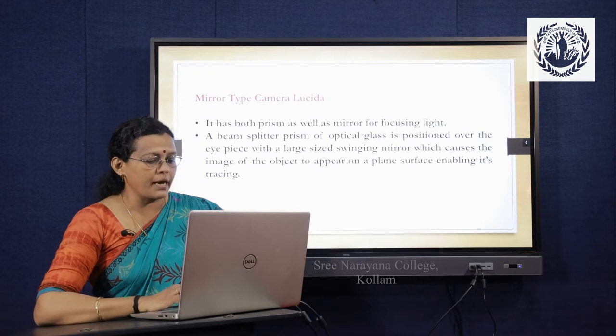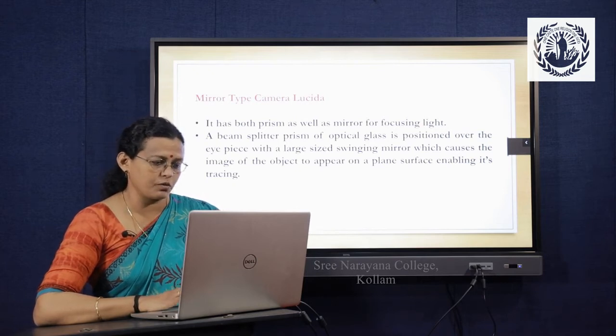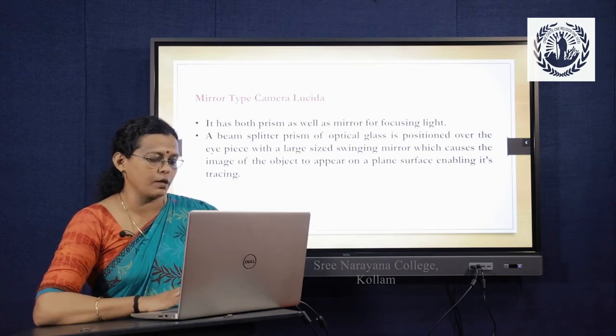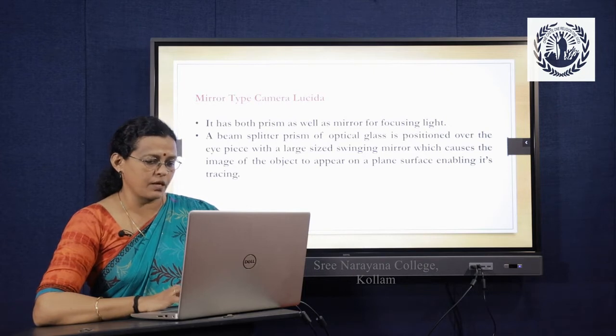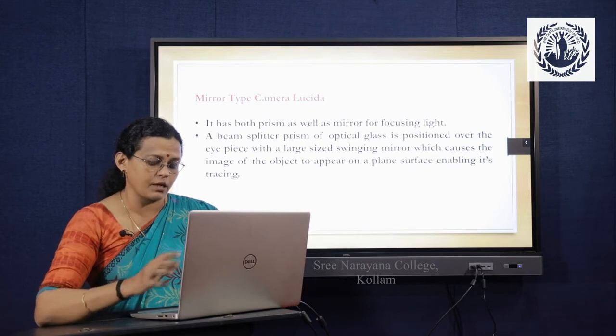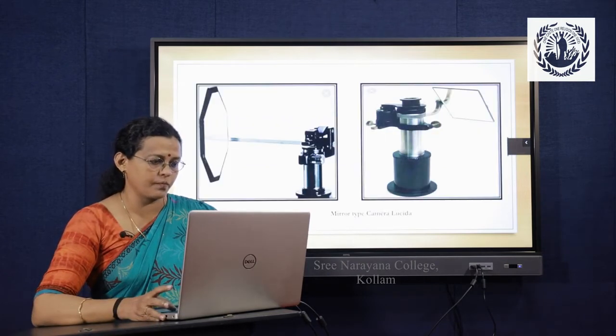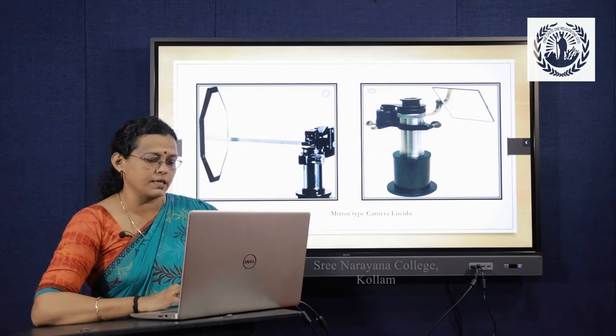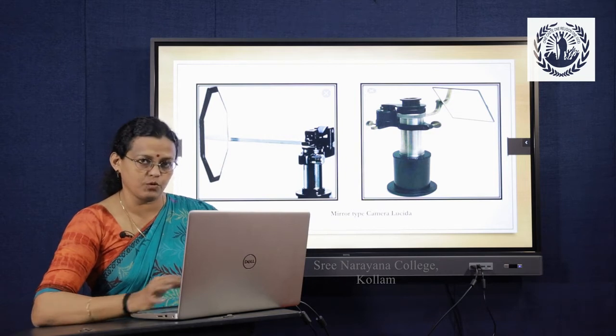The next type is a mirror type. It has both prism and mirror along with the attachment ring for focusing light. A beam splitter prism of optical glass is positioned over the eyepiece with a large size swinging mirror, which causes the image of the object to appear on a plane surface, enabling its tracing. I'll be showing you how you actually mount this camera lucida on a common microscope. So this is a picture. Here you can see the body tube of the microscope on which, with the help of the attachment ring, it has been attached, and there is a mirror that is inclined at a particular position.